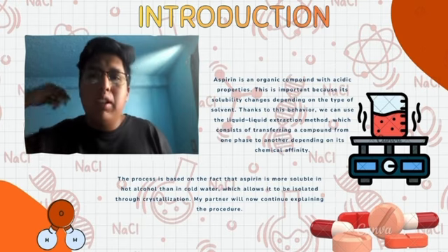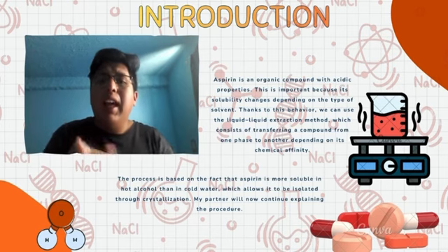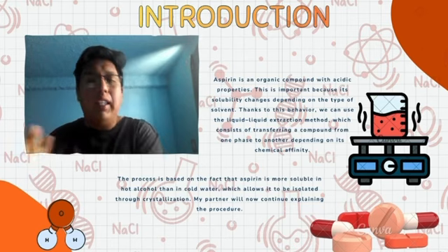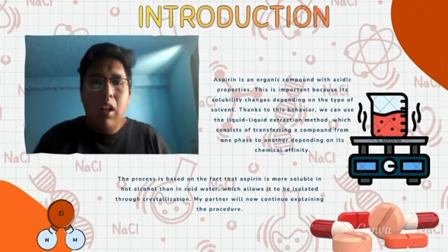We're going to present the experiment on the extraction of acetylsalicylic acid, better known as aspirin. The main objective is to separate and recover the active ingredient mixed with the excipients in commercial tablets.